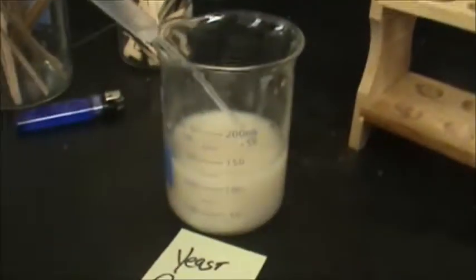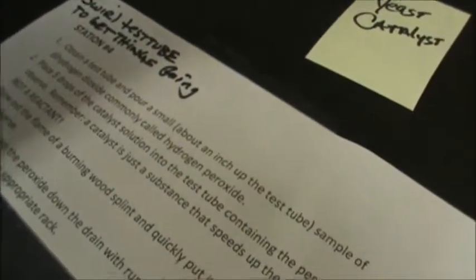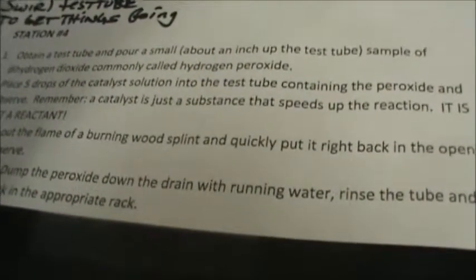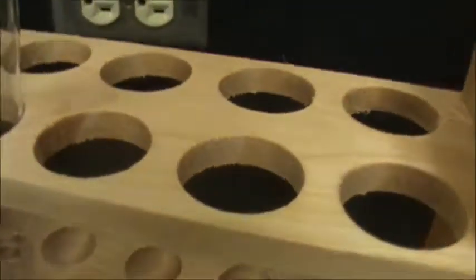Again, the catalyst is sitting in this beaker. It says to add about 5 drops of catalyst to this. And then we're going to be messing with a wooden splint in a second. So again, it says that we're going to place 5 drops of this catalyst solution in the test tube that contains the peroxide. So let's watch what ends up happening.